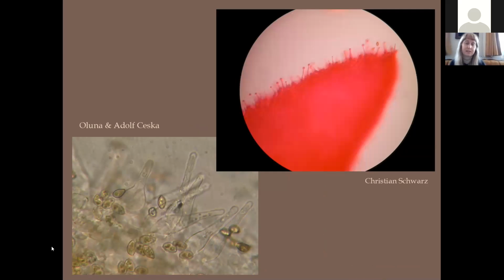Okay, so here are some micro photos of the actual mushrooms that were in the last slide. And the features that we're looking at here are called the cheilocystidia. They are cells that are right at the edge of the gill. So the one in the upper right, these cells right here that are like long sticks with a little circle on the end, that's cheilocystidia. And each one of these over to the left, it's zoomed in farther, that look kind of like bowling pins, those are also cheilocystidia, or singular cheilocystidium. So you can see that those two things look quite different. So you're going to be able to compare them microscopically pretty easily.